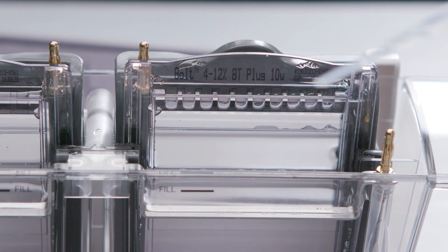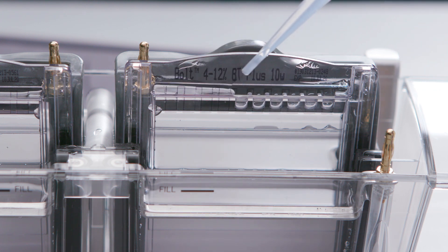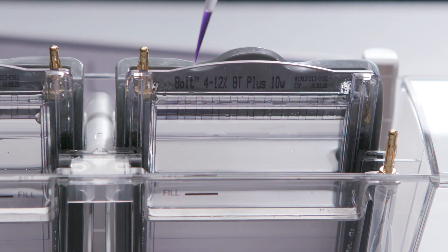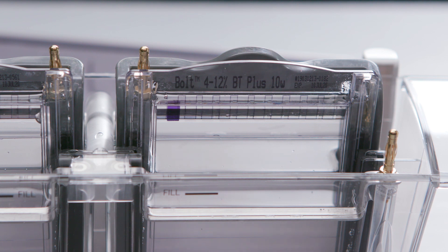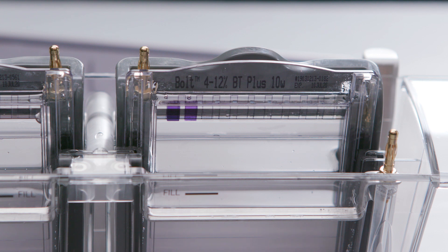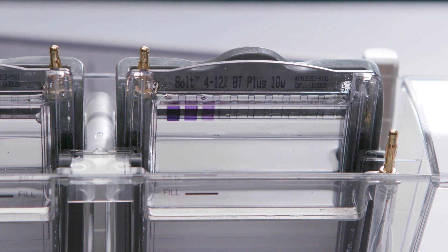If you're running two gels, repeat this for the other gel. Fill the wells of the gel with running buffer. Simply lower the pipette tip into the well and pipette the sample in. The front-loading wedge-shaped wells make it easy to load samples using a standard pipette tip. Load the pre-stained ladder into a separate well in order to assess the relative molecular weight of the target proteins and monitor the separation during electrophoresis.